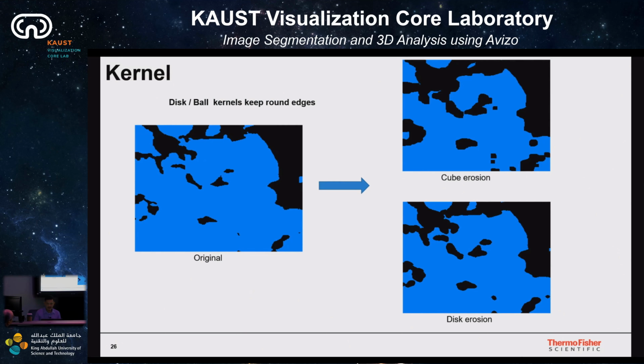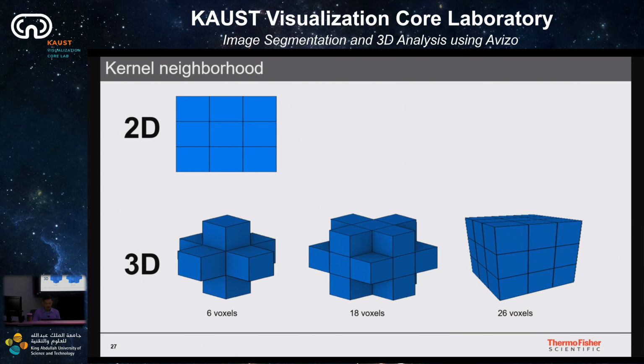So if you work on some kind of erosion, you can see, because we look at the 2D, the way they erode by a certain number of pixels. If you define that you want to shrink or erode them by 1 pixel, you can see here, for example, where my mouse is, after you erode them, they start to open up in shape. The pixel is more cube-like. And this is what I mentioned about the 3D interpretation.